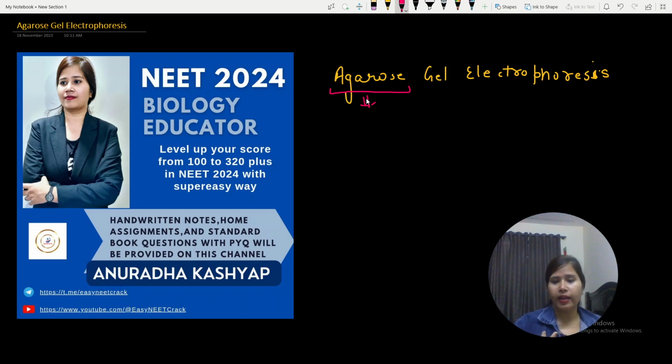But here we are talking about a supportive media. What is your supportive media? Here you are using agarose. Agarose is a jelly-like substance, obtained from a kind of algae. I am talking about a plant, but it is not a plant. From algae we obtain this semi-solid, semi-liquid material, which is your agarose. So first of all, this is your supportive media.